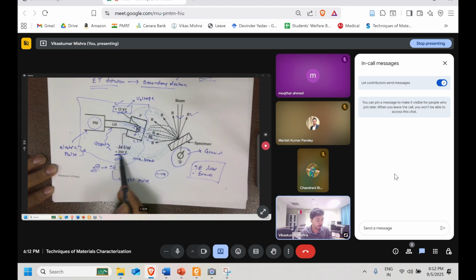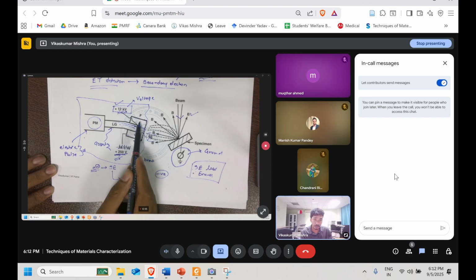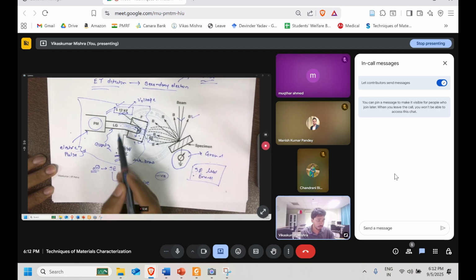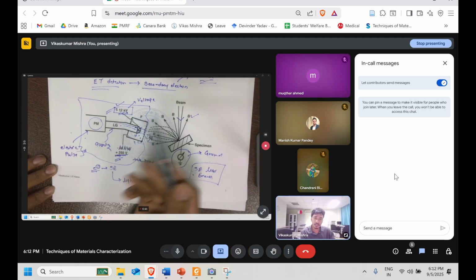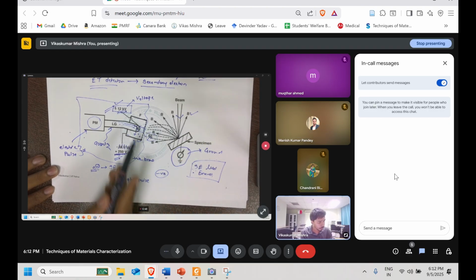We applied something around 250 to 300, one can say. And once this electron, the secondary electron, entered this particular cage, we are accelerating it with this particular bias. Okay, 12 kV. In class we saw it written as 10 kV. So both are fine. Okay.